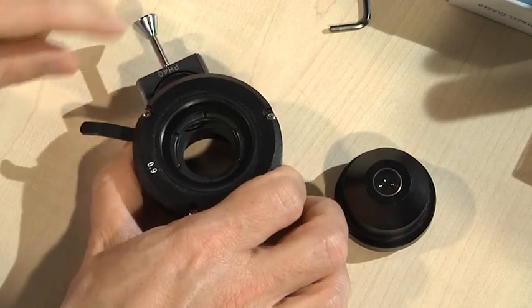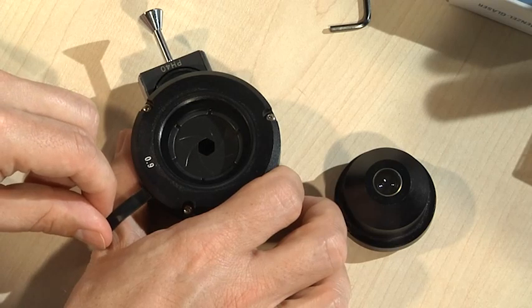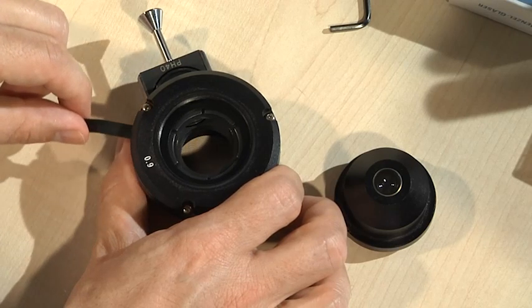You can see that just one of these apertures can be used at a time. Both are important for enhancing the contrast of the image, but in different ways.